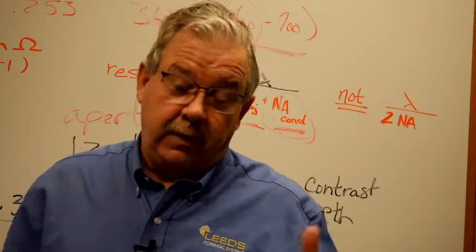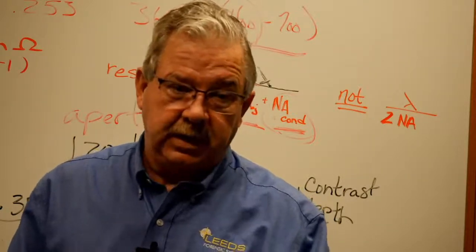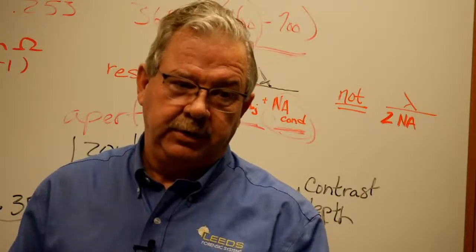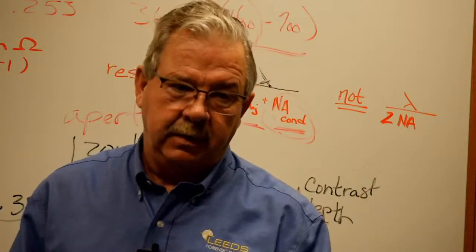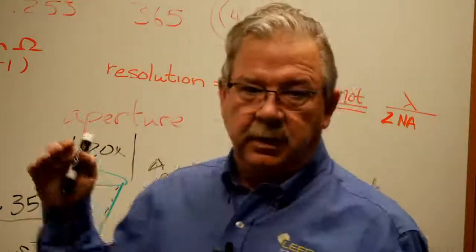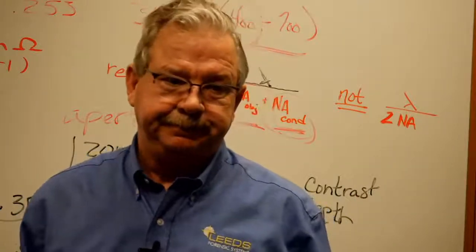So now, if all I really need is extended depth of field and it's not as much contrast, we can use electronics to rebuild images and show me that depth. But in pure microscopy, we're always balancing resolution with contrast and depth.